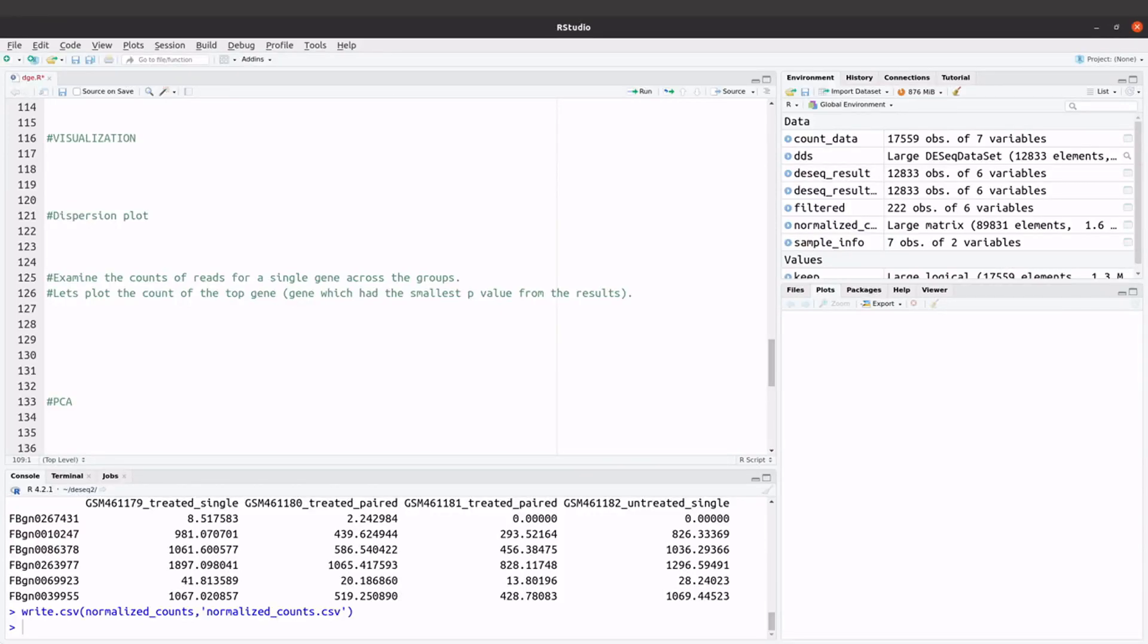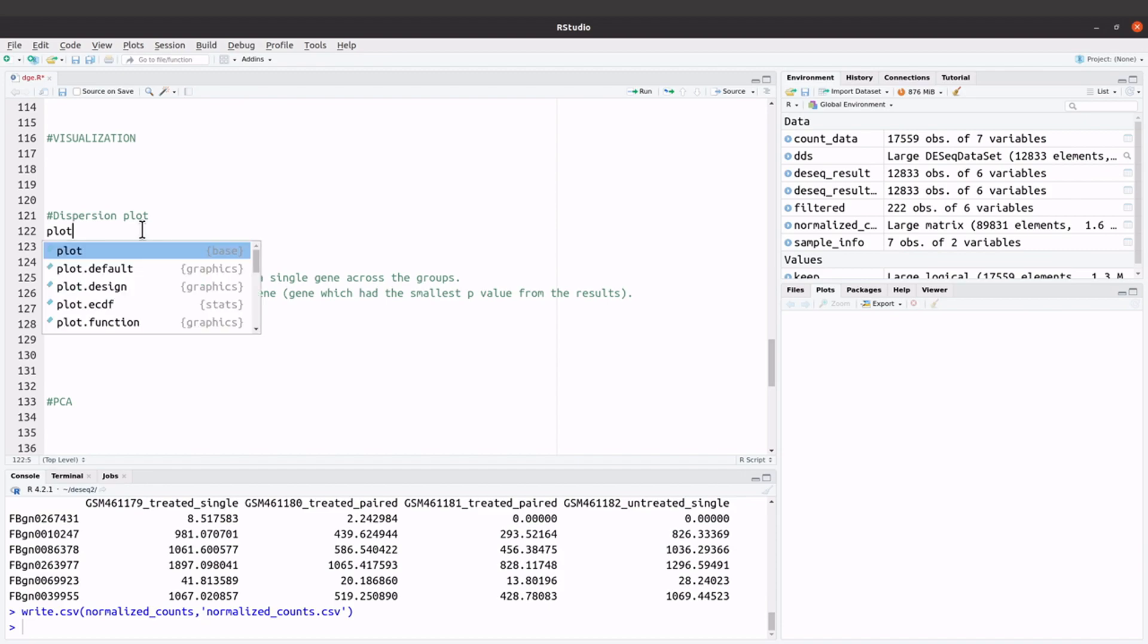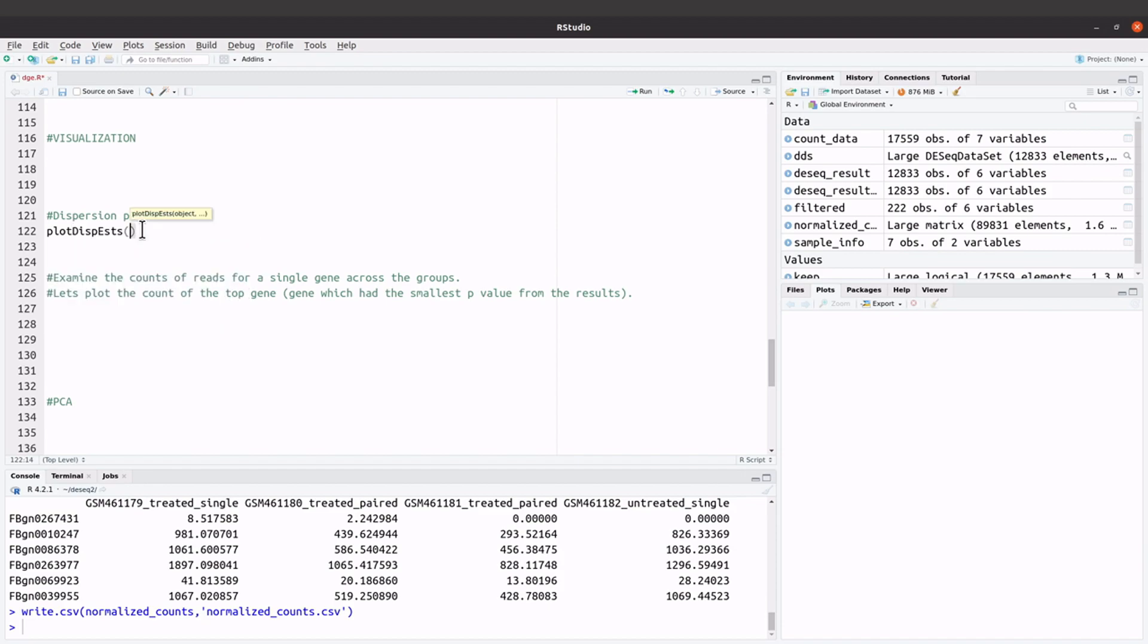We are now going to visualize the DESeq results. We will start by plotting the dispersion estimates, so we will say plotDispEsts and then specify the DESeq objects, so we will say dds.